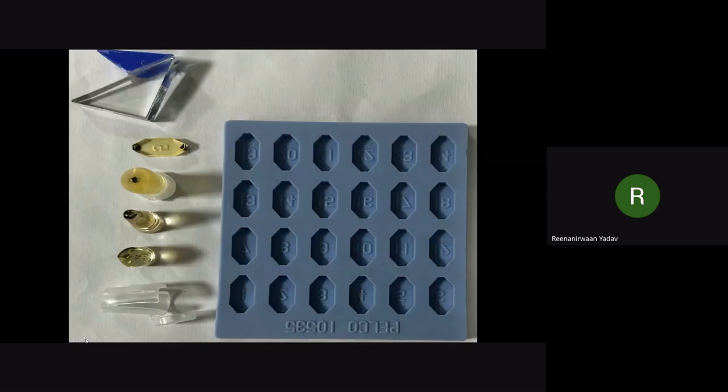So here we are representing our mold that we are using for embedding our sample, and we can also use the capsule one, that is the second one, and these are the blocks which represent our sample. And the upper one has a glass knife attached along with a boat to collect our sample.